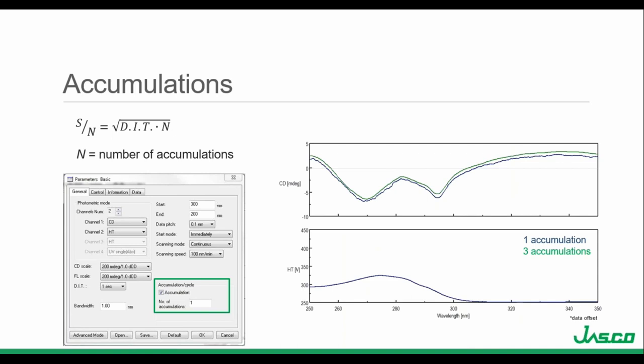Once we have optimized the scanning speed and DIT, if the signal to noise is still relatively low, we can look at increasing the number of spectrum accumulations — the number of spectral scans automatically obtained and averaged together. The spectrum signal to noise is proportional to the square root of the DIT multiplied by the number of accumulations. While increasing accumulations improves signal to noise, it also increases measurement acquisition time since the measurement is repeated for each accumulation. Selecting accumulations means each individual measurement will not be saved — only the average accumulated scan. The spectra on the right show a single scan in blue and three accumulated scans in green, and the accumulated scan has better signal to noise.